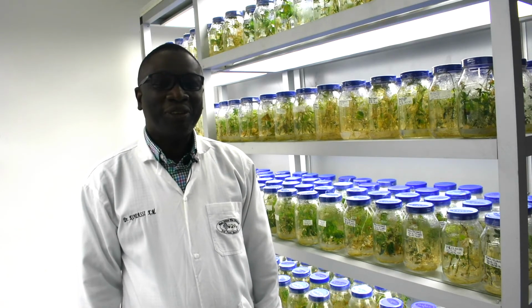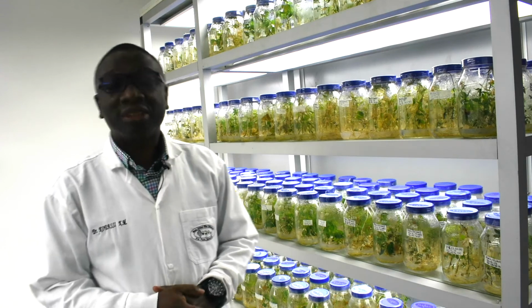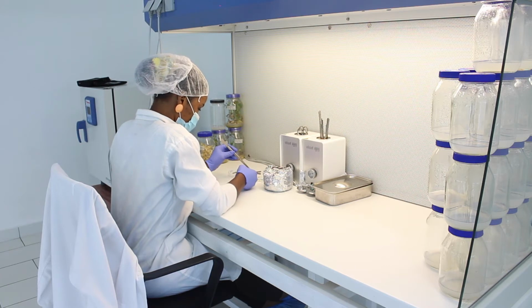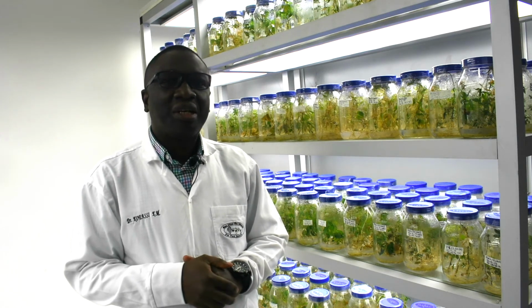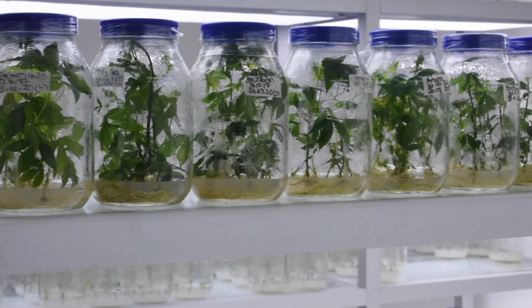I'm Kwasi Modeste, the manager of the Plant Tissue Culture Lab. And in this lab we work mainly on sanitation of the plants using meristem culture plus thermotherapy. And after sanitation we do the conservation. And here, for example, we work on cassava.